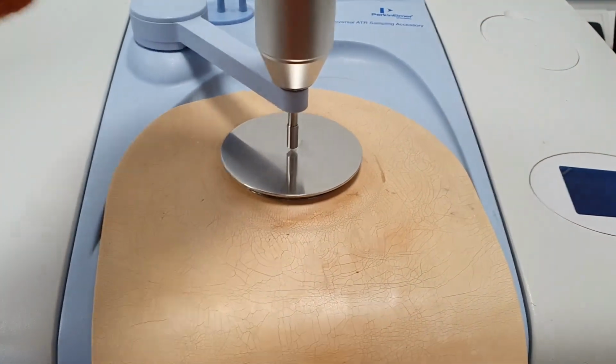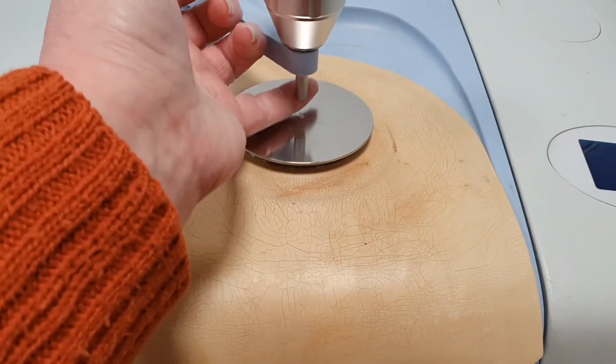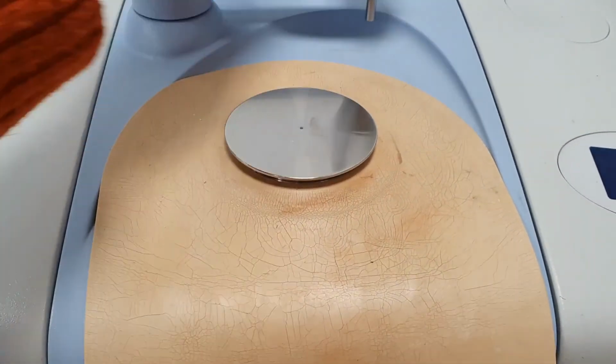Make sure to release the lever and clear away any residual sample when you're finished the test.